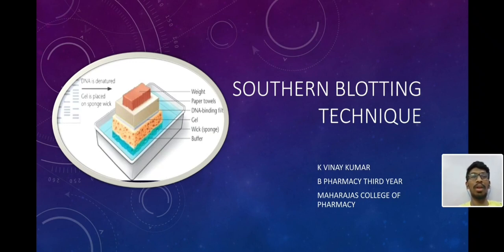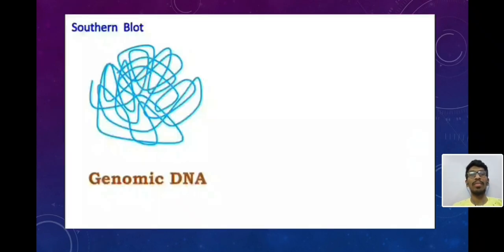Today I am giving a seminar on the topic Southern Blotting Technique. It is a molecular biology technique used to detect a specific genetic sequence in genomic DNA. This technique was introduced by Sir Edwin Southern in the year 1975. Now I will go through the process in detail.